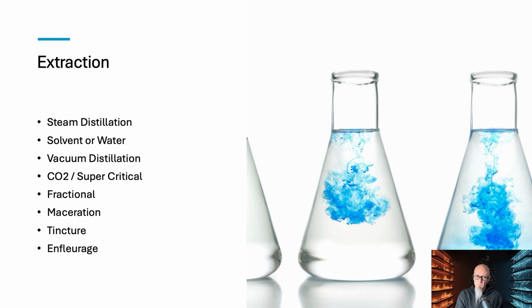Vacuum distillation is a little bit different. So this can apply to the same types of plants where maybe the boiling point, the burn-off point, the scorching point, is what actually forces the compound to degrade. Maybe that boiling point is lower than what you can get with the solvent, right? Water is a very good example in steam distillation for essential oils. Generally, you will run it right around 100 Celsius.